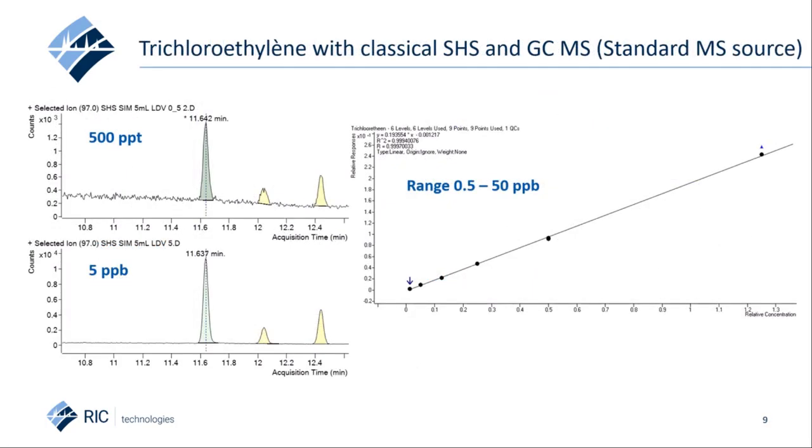The same analytical method applied for trichloroethylene, for example, shows better performance. Of course, still showing the limited sensitivity obtained by conventional static headspace injection, nevertheless sometimes sufficient for the area we work in. This can be clearly observed from a 500 ppt and 5 ppb level spiked water sample, depicted here. But again, calibration within a sometimes acceptable range shows a good result.